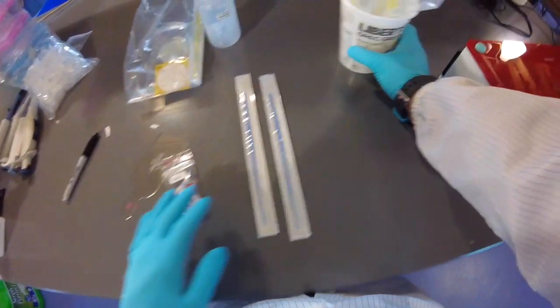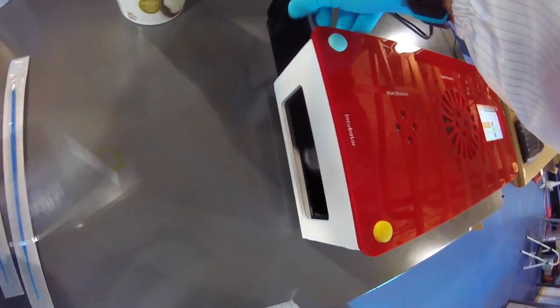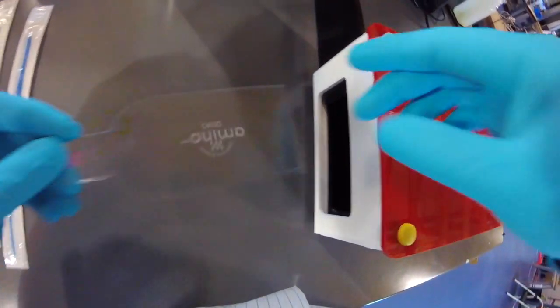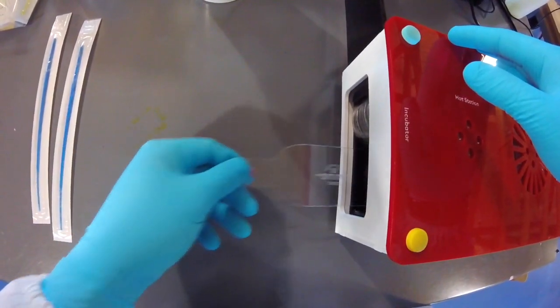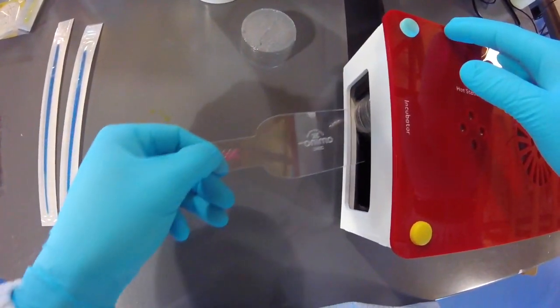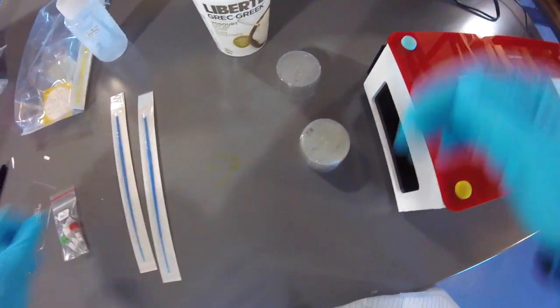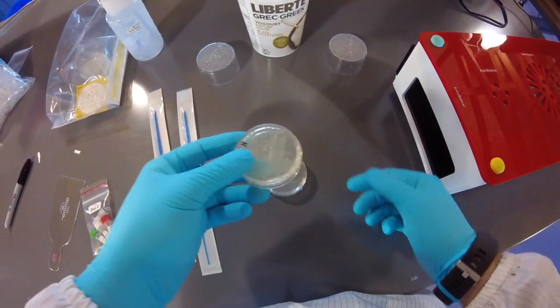And let's have a look at our cells and see how they grew. Just going to open up the door here. This little pizza scoop here. There we go. Come on. Oh, there's another humidity chamber in here. Let's get that out of the way. And let's get our cells. Okay. So here's our cells. So that looks pretty good.